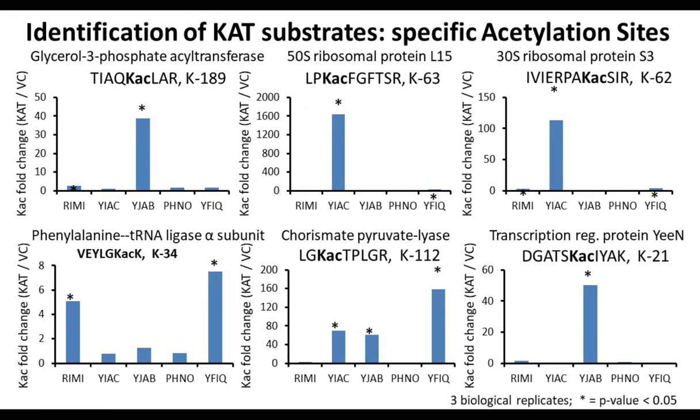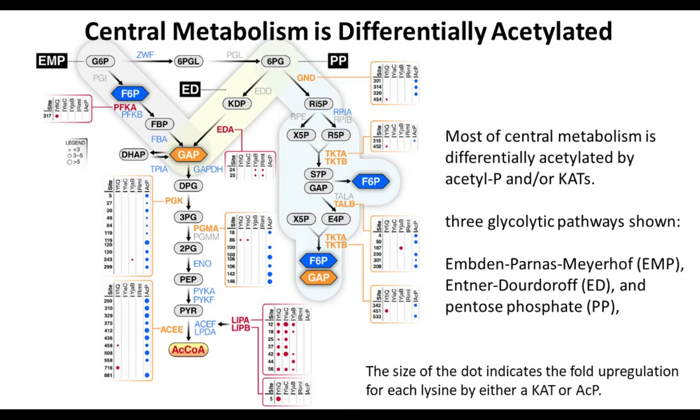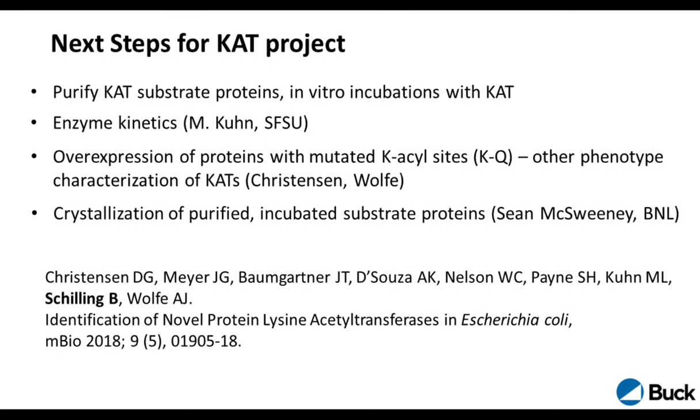Again, I wanted to emphasize that this project was really only possible by having a good, efficient, and reproducible enrichment strategy, because we were also working in a label-free environment, so everything has to be really reproducible. It was interesting to see biologically that much of the central metabolism was affected here, and the little dots in red or in blue in the tables indicate which of the cuts had specificity for these sites. So this was biologically rather interesting for our collaborator.